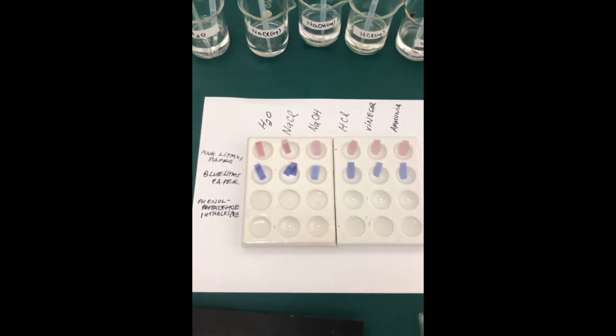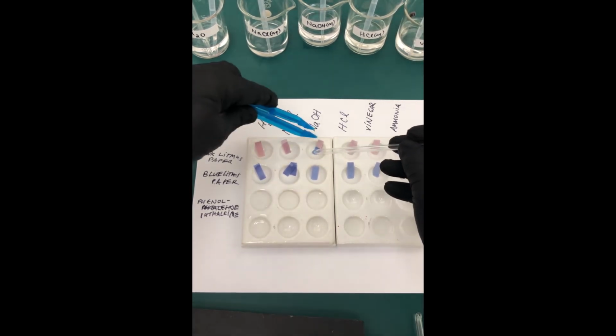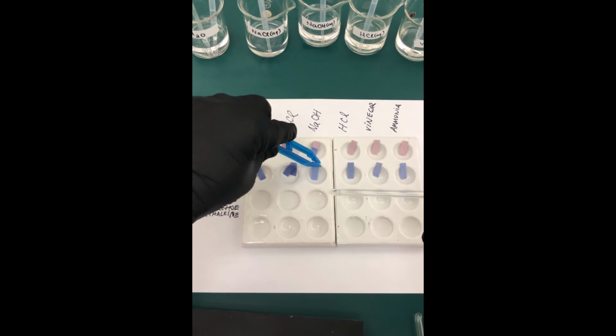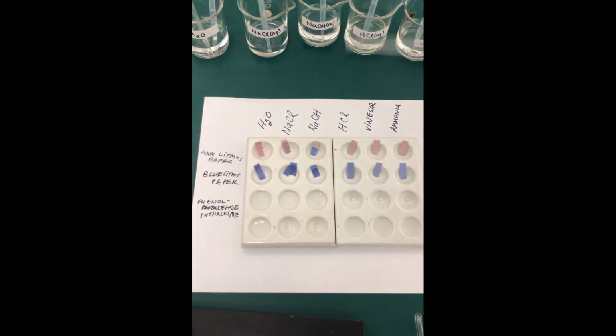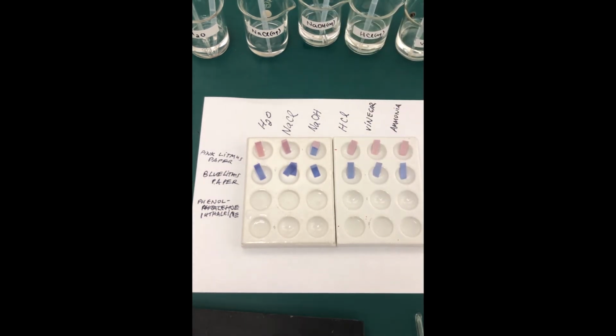So let's try out the NaOH first against the pink litmus paper. Again, we're just going to put a drop in there. And see, you can see now a real color change. Let's try it against the blue litmus paper. And as you can see, all it does is get dark because it's getting wet. But you see a significant change in the pink litmus paper versus the NaOH.